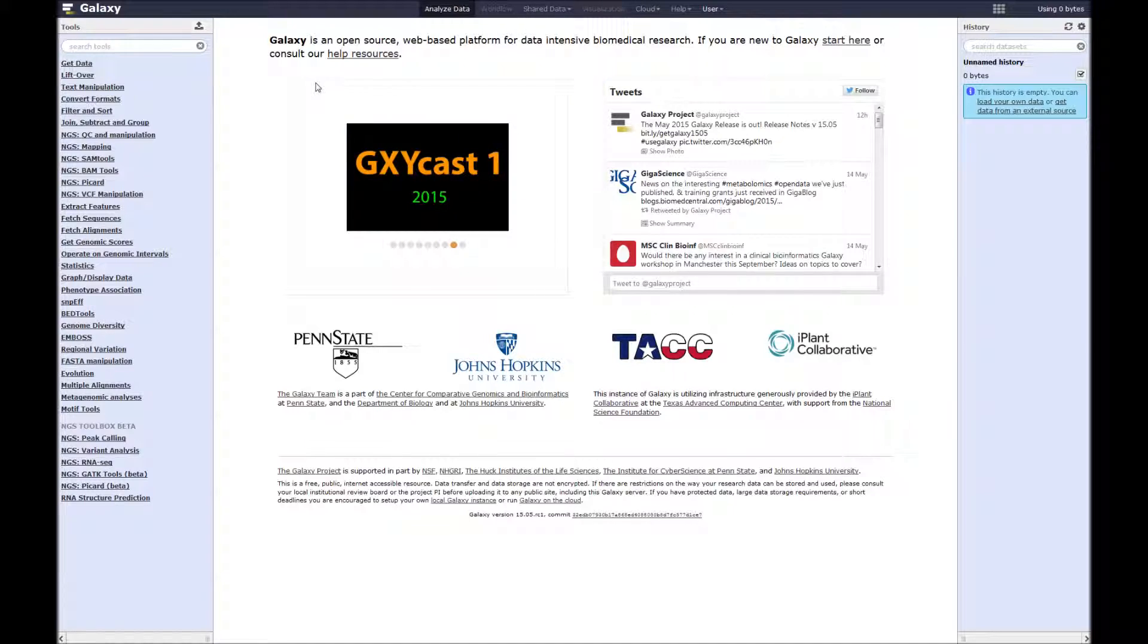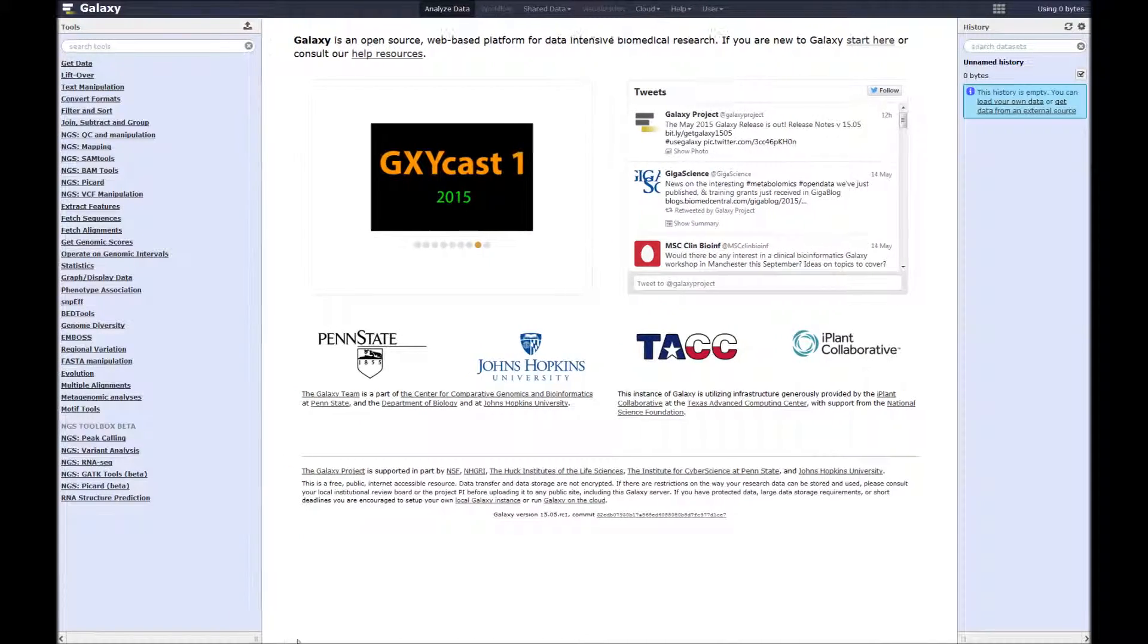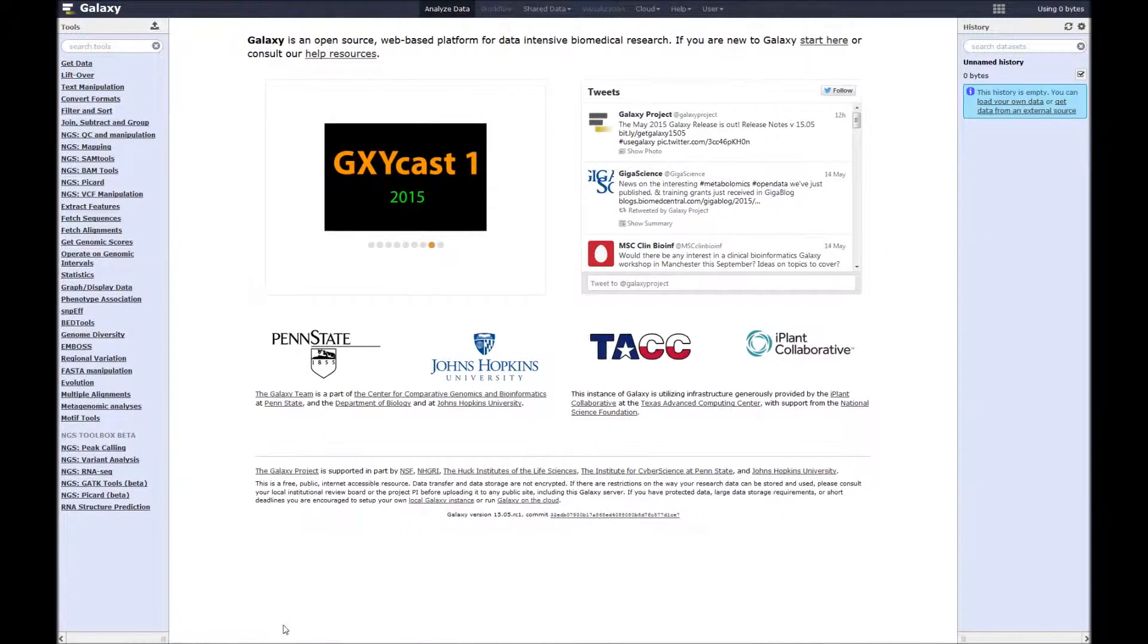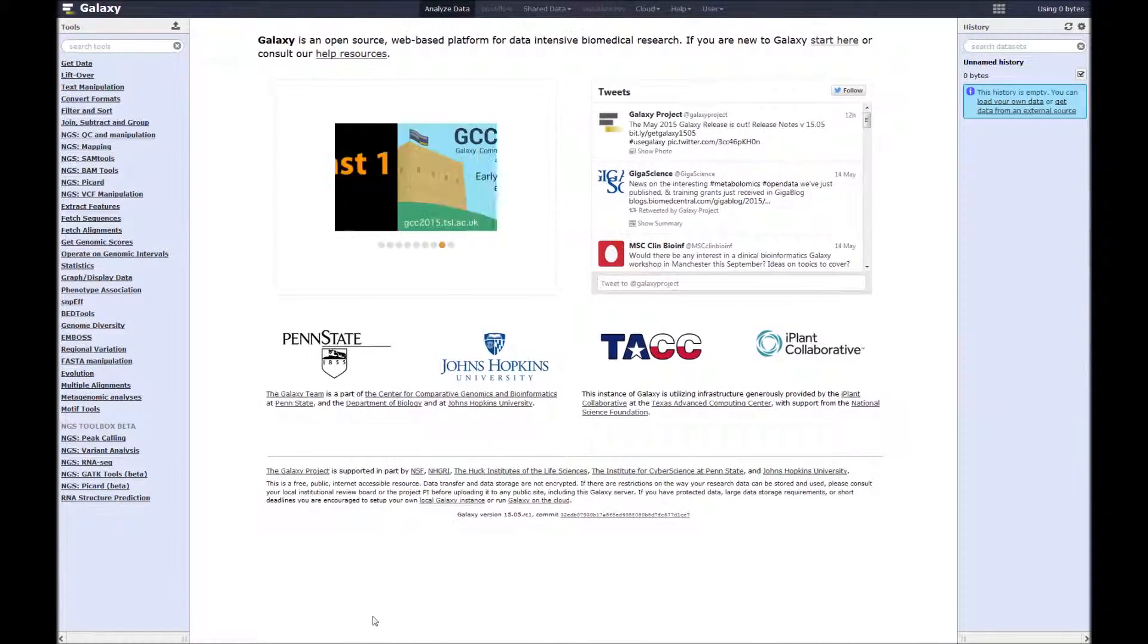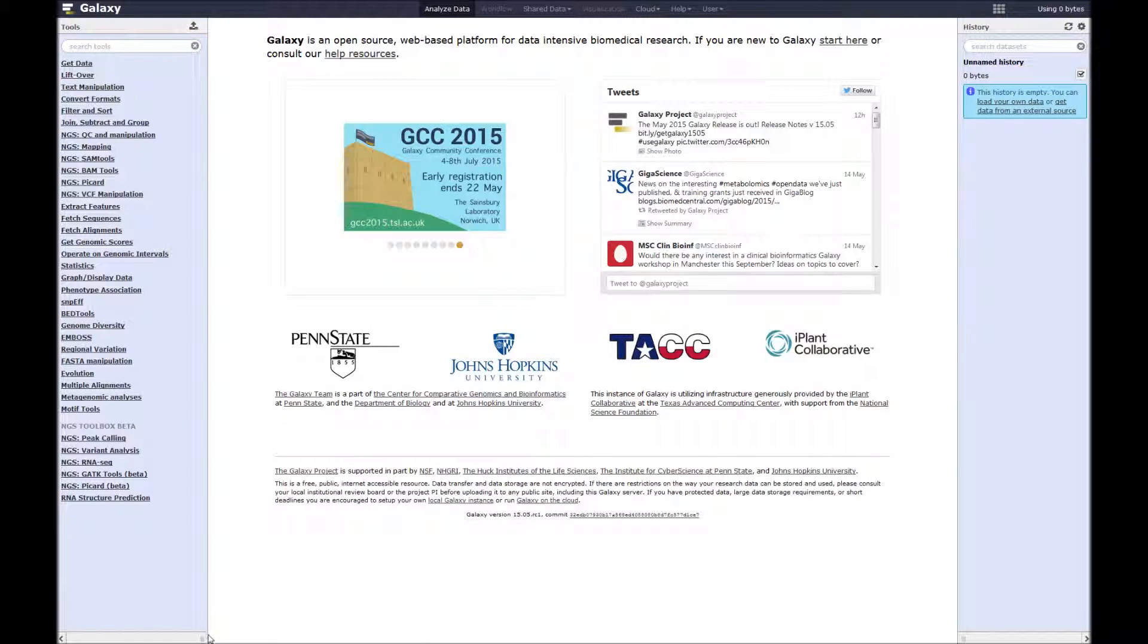There are three main areas. You've got the tools menu on the left. These different parts of the screen you can click and hold and drag to make them bigger or smaller. You have the results viewer in the middle. And then on the right hand side you've got the history where your data files and results appear as you work through a workflow.